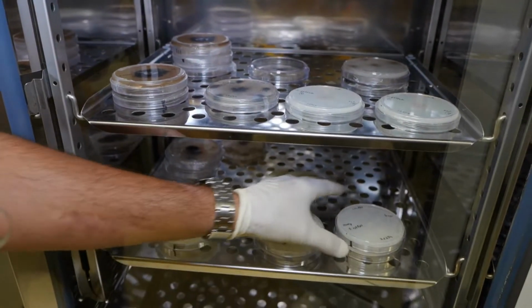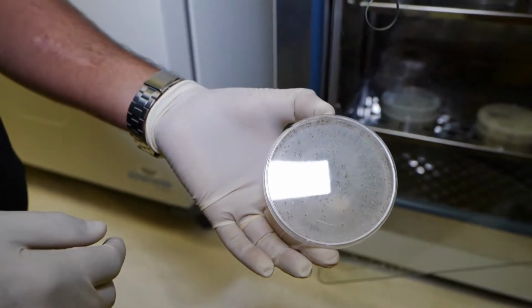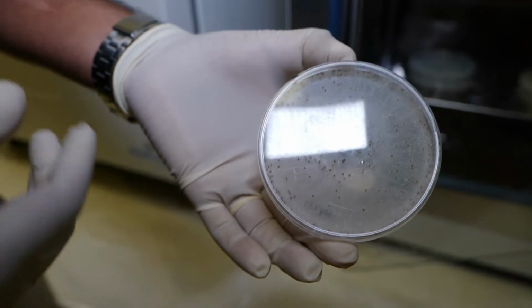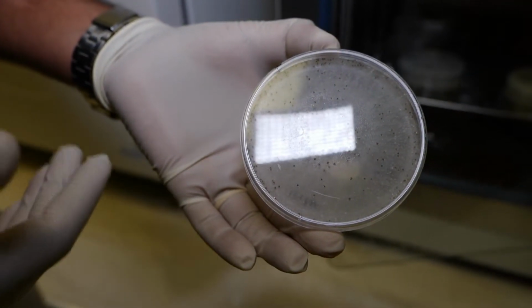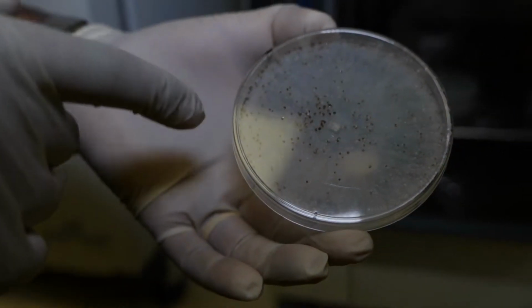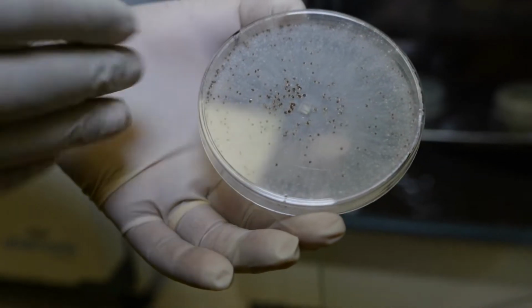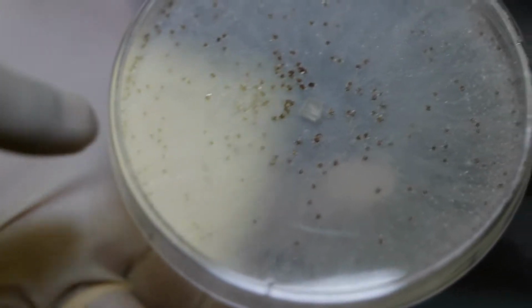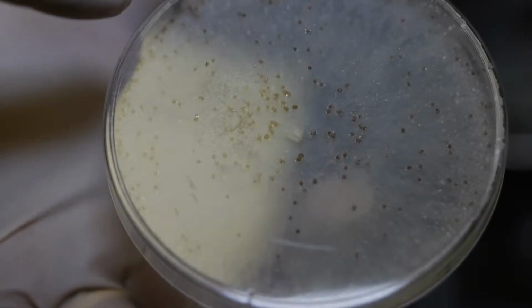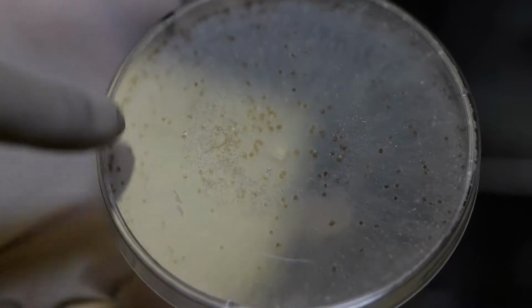Here is a good example from hemp, industrial hemp. The plant was infected with southern blight, and once we grow it, this is a classical example where the southern blight is producing the sclerotia, a mustard seed size, shape and color, sclerotia in the plate.